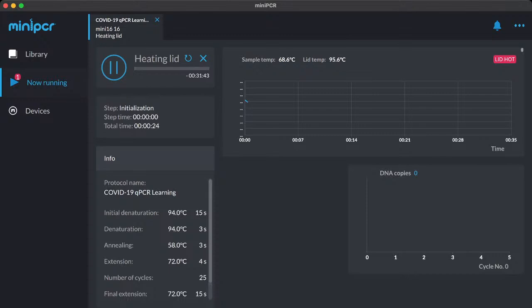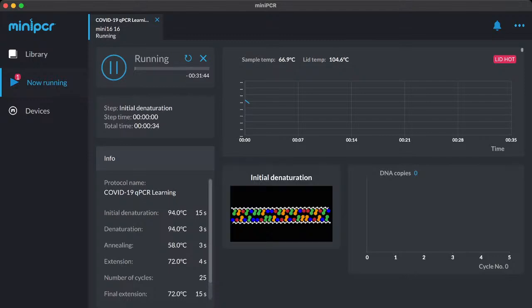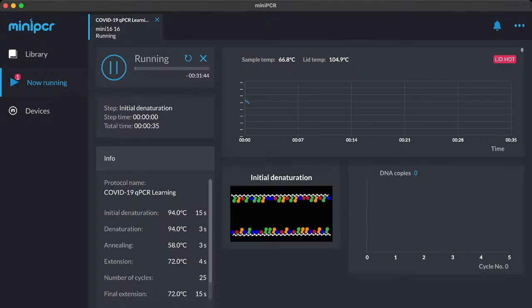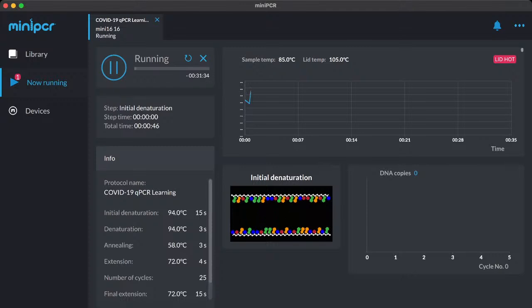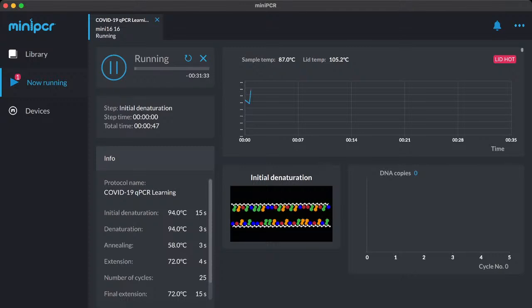These are going to go very quickly — the entire PCR can run in about 35 minutes because we're only going to run 25 cycles. I'll click save and run to start the run going on my mini PCR thermal cycler. As this loads, we have a description of what's going on — we're initializing and heating up the lid. Down below we have all the different parts of our protocol, and as this runs, we're going to start to see a graph of the temperature. We're starting our initial denaturation — you can see the two strands of DNA coming apart in the animation.